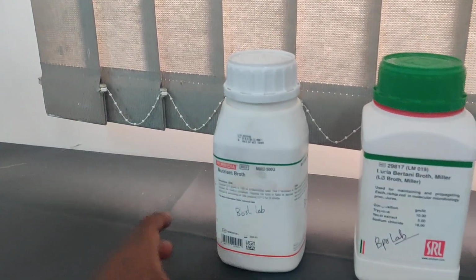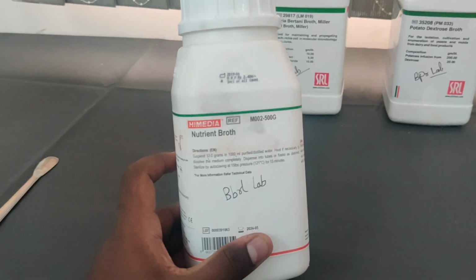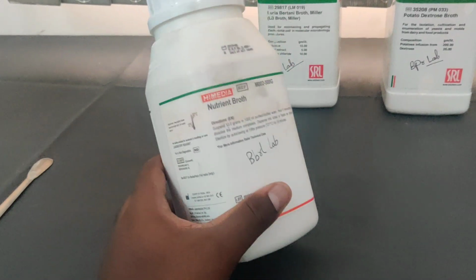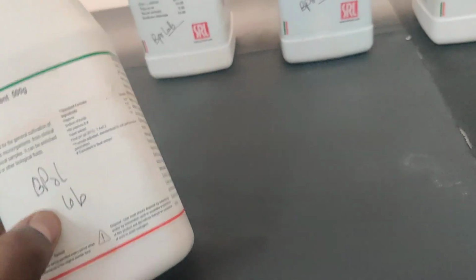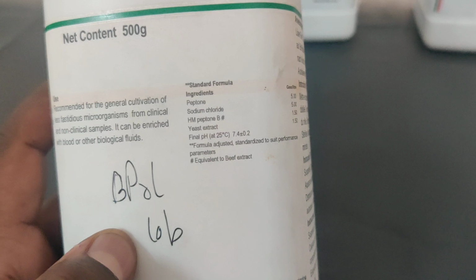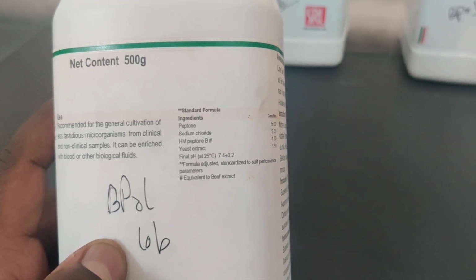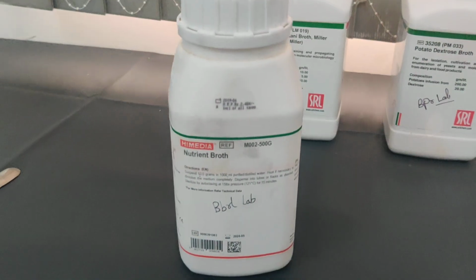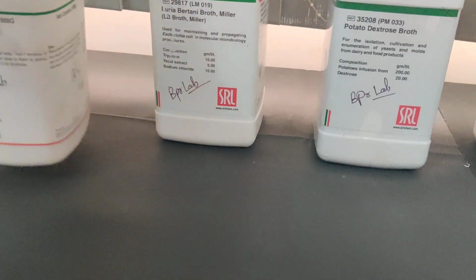I will go ahead with one example, which is nutrient broth. As I have told you, among the different types of mediums, this belongs to the general purpose medium. The composition of nutrient broth is very clearly given: peptone, sodium chloride, HM peptone B, and yeast extract. This is a very simple composition. If you don't have a complete nutrient broth, you can also depend on the individual components.